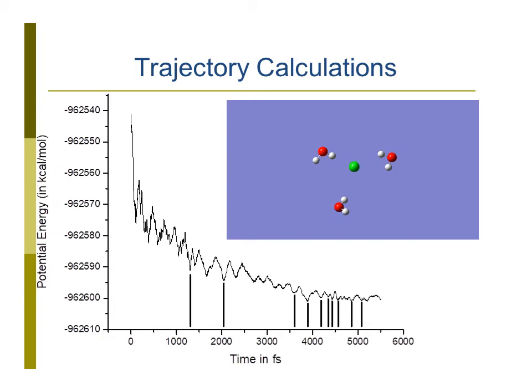The ions fly slower or faster depending on how they are shaped. It's like a car. I mean, a race car is clearly differently shaped than a lorry. And we all would assume that with the same power, a lorry would never be as fast as a car. But this is exactly how we measure the mobility. We measure how fast are the ions traveling.